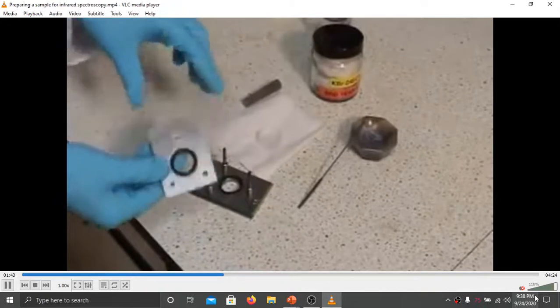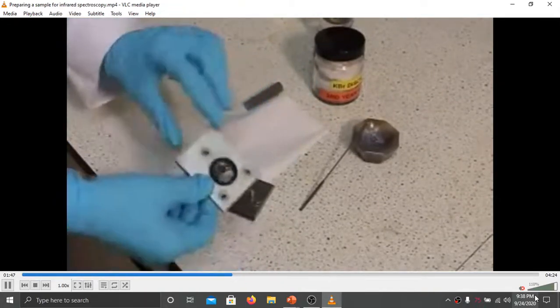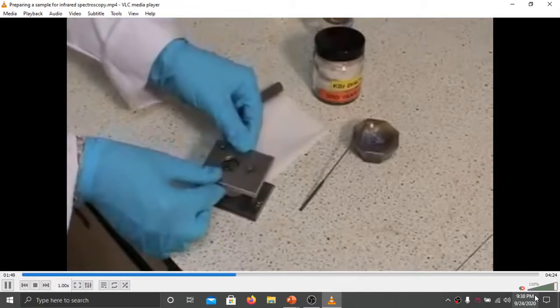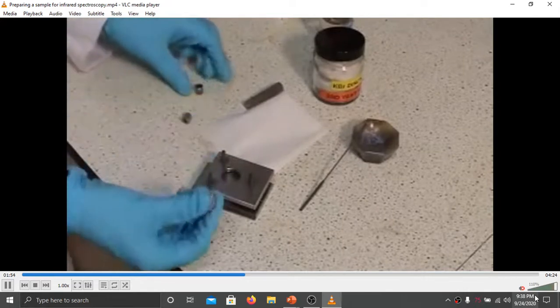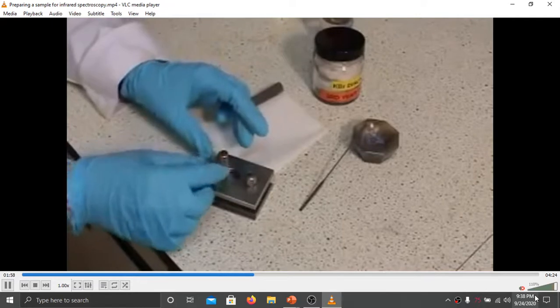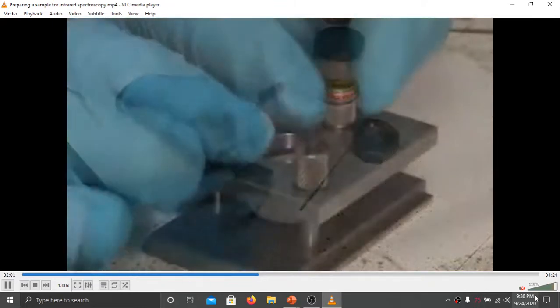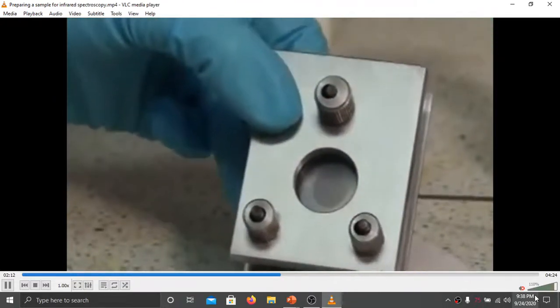Two types of holders are used. I am showing both of them. So this is the gasket which is holding. Then another plate is to be placed on the surface. Rubber gaskets are there for protection. When we are applying the pressure, equal pressure should be applied on all sides so that there is no crack in the plates. So equally we will tighten this plate, this screw. Then this is the smear which can be placed into the compartment.